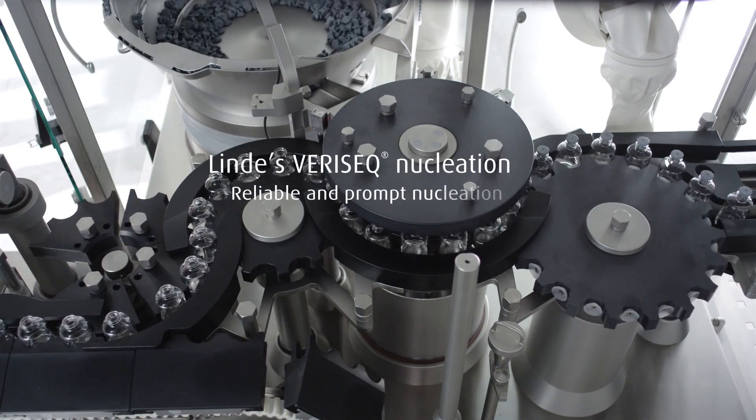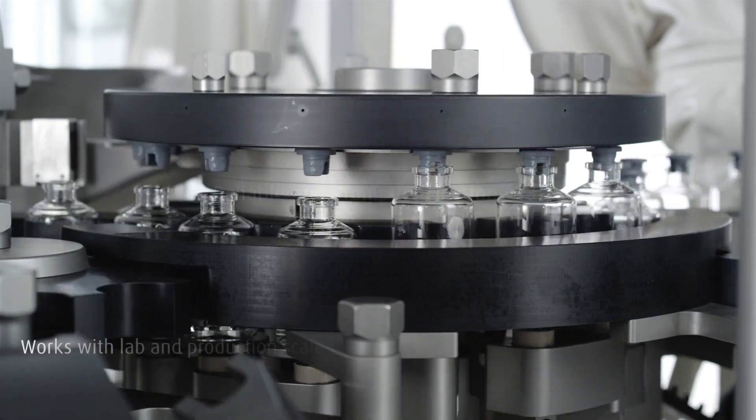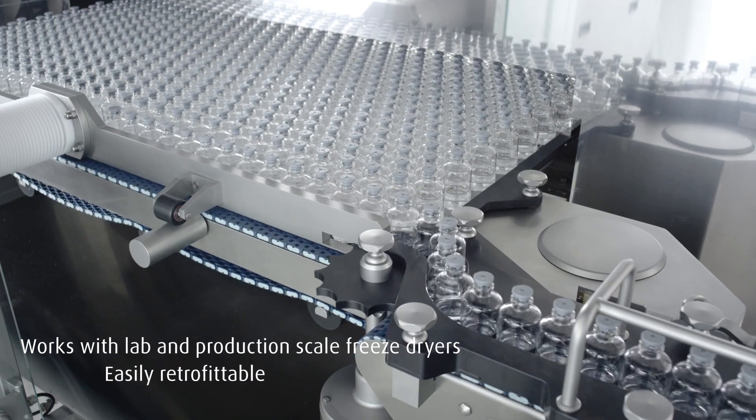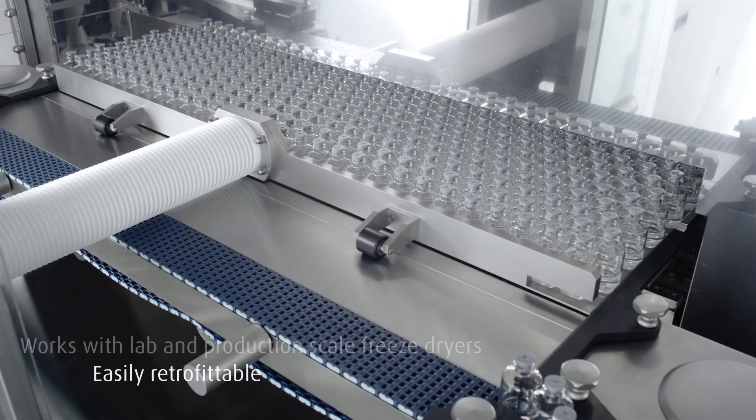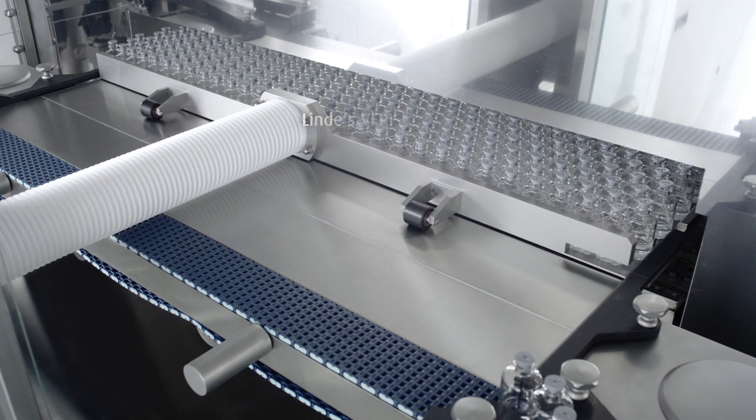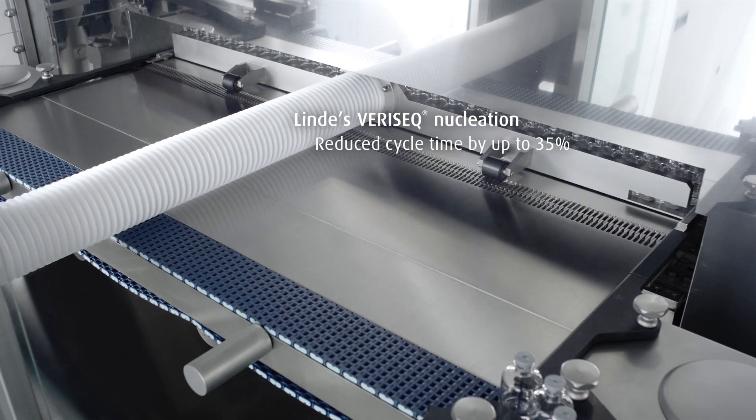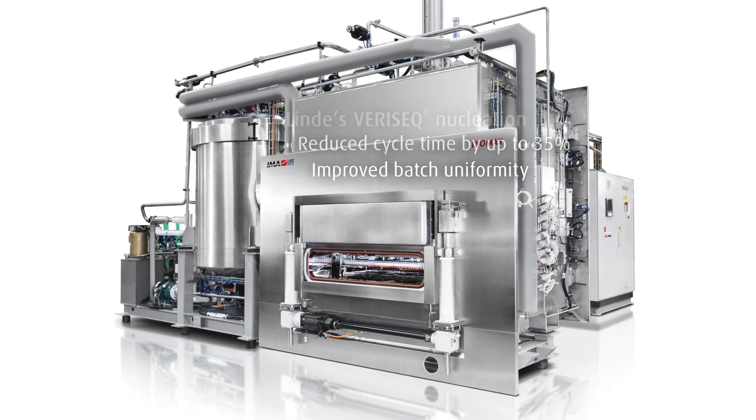This ensures reliable and prompt nucleation of the product at the optimum temperature. Veriseq nucleation works with laboratory and production scale freeze dryers and is easily retrofittable to any freeze dryer size. With our Veriseq nucleation technology you can reduce overall cycle time by up to 35% and significantly improve batch uniformity.